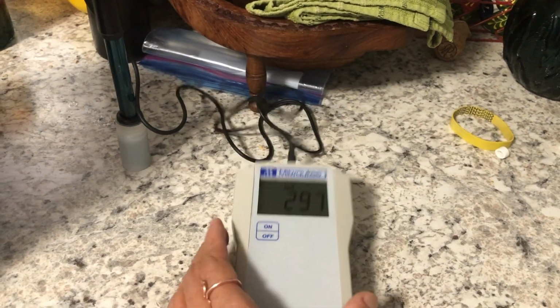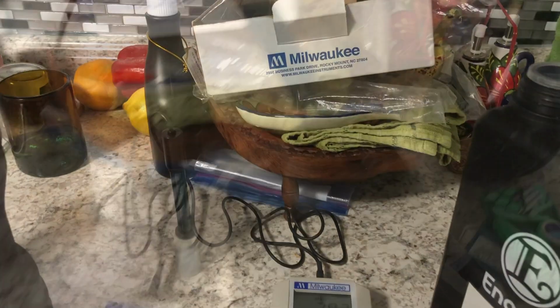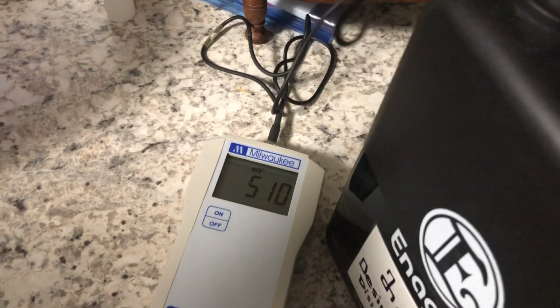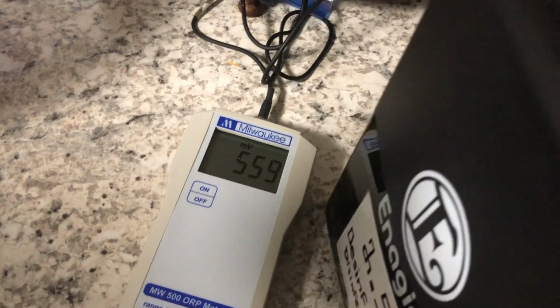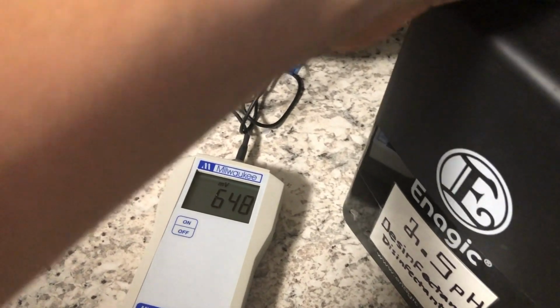So here we go. We're gonna first jump the meter. Okay, with this meter we should get a pretty acidic reading, which yes, it keeps going up. This water is not fresh. It's been here for about a week. It's the 2.5. It acts like a disinfectant, but I think we've shocked it pretty good.